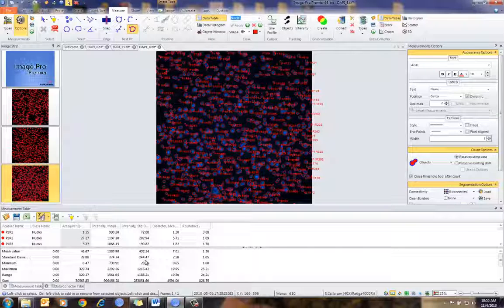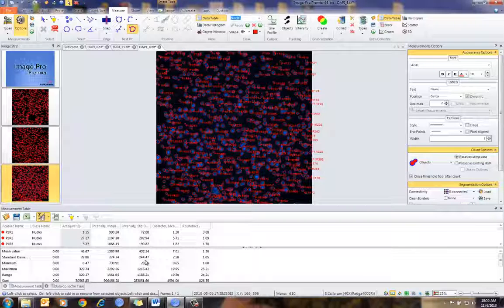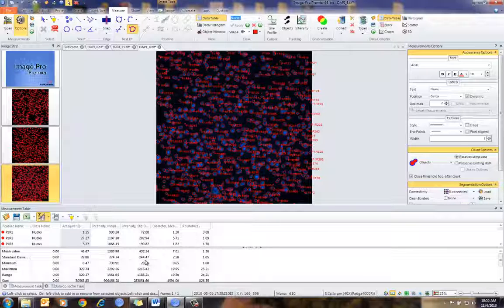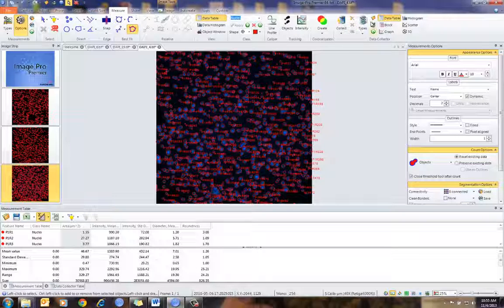That's a very powerful way of automating your processes. As I mentioned, this can actually be tied into batch processing under the automated tab — where if I'm automatically counting a folder of images, say 100 images, I can automatically set this up to accumulate the data in Data Collector and then report out that data in the format I've set up.